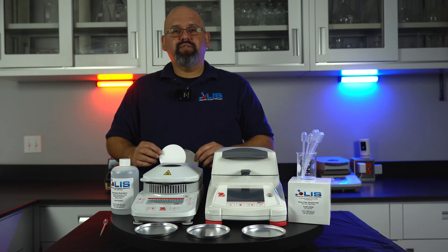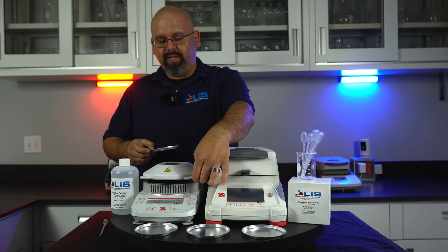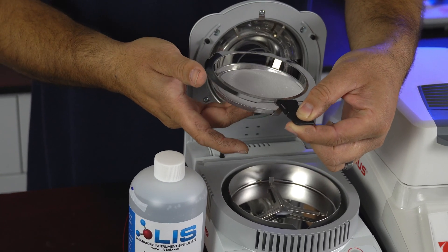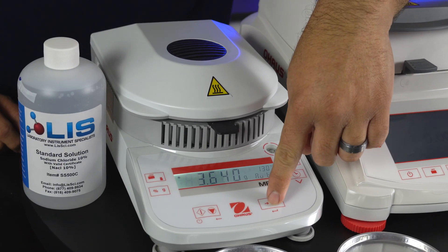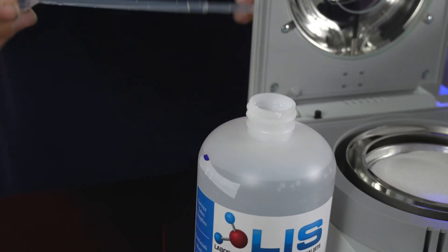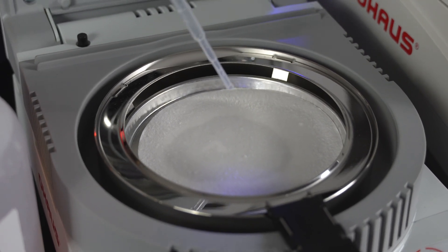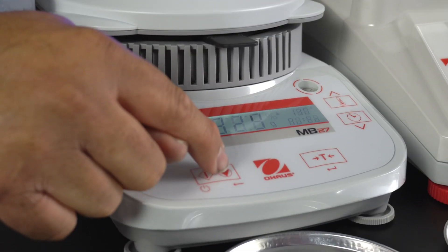We will now be testing on the O-House MB-27 using an aluminum dish and sample pad. Insert the sample pad on the aluminum dish. Open up the lid on the MB-27. Remove the sample holder and insert the aluminum dish through the side of the sample holder. Insert the sample holder in the cavity. Close the lid and press the T for tear. Once it shows zeros, open the lid and apply your sample. It is best to distribute the sample evenly along the sample pad to give you better and accurate results. Close the lid and press the triangle button to start the test.